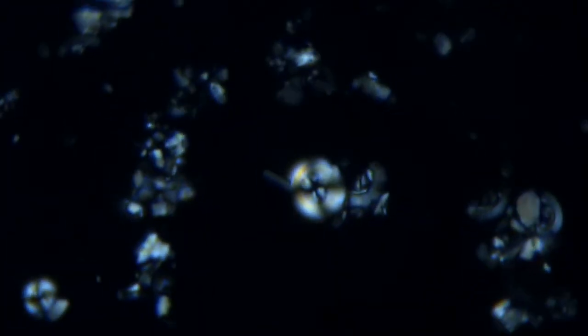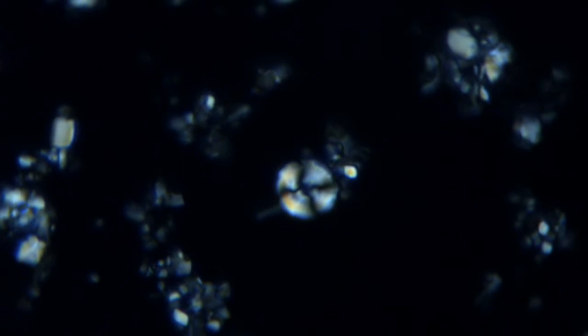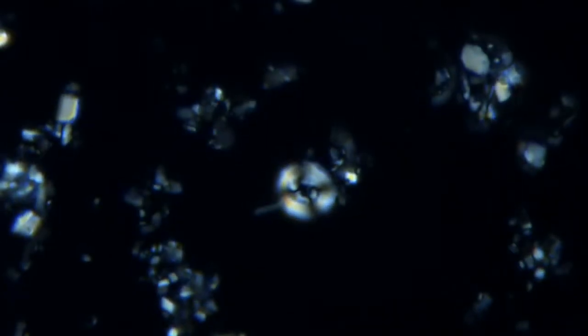Note that the following procedures are not used or necessary on calcareous nanofossil observations. We'll only mention them to complete the description of the optical properties of calcite, and also to comment on the current use of the term isogyre to describe the extinction pattern of calcareous nanofossils.